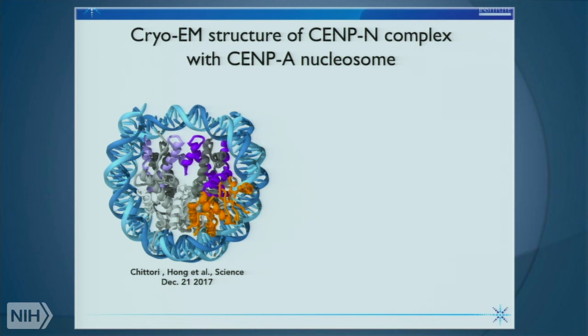But it also really changed for us the way, and it is reflective of the way, that cryo-EM is now being used, where without the biochemistry and the cell biology that Yawen Bai's lab and Alex Kelly's lab did, we would really have no idea of the mechanistic aspects of this complex.